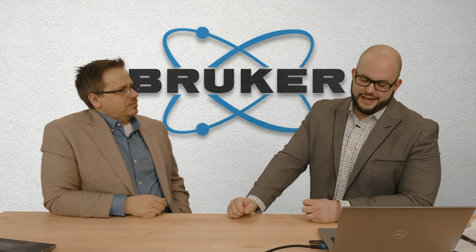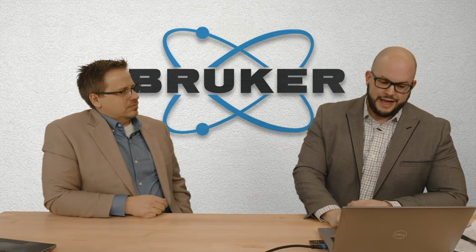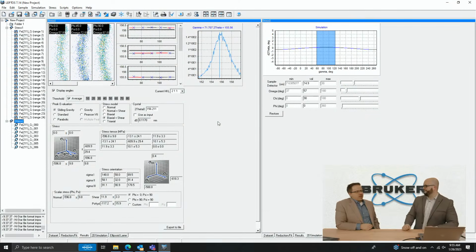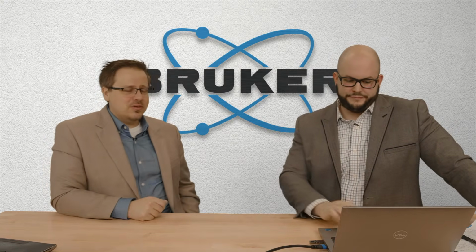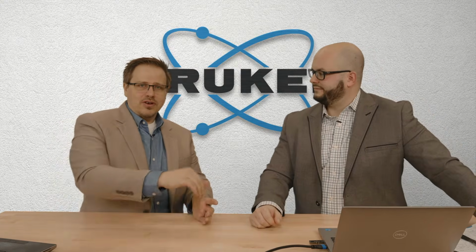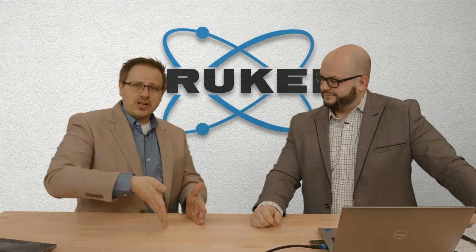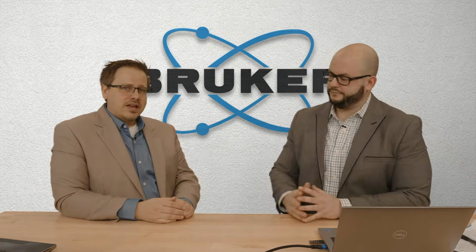But, I mean, you can see right here, this gives you 5 data points as opposed to 1 data point, right? Yeah, for me, that's been about the factor. About a factor of 5. And where this becomes really useful too is there's another function in Leptos where you can actually do stress mapping. Like I took a razor blade, and then we actually mapped the stress all along the razor blade. It's really neat, actually. It's a cool exercise if anybody wants to do it. Because where it's cut out, sometimes you're going to see a different stress near that. And then also near the edge, you might see a stress.